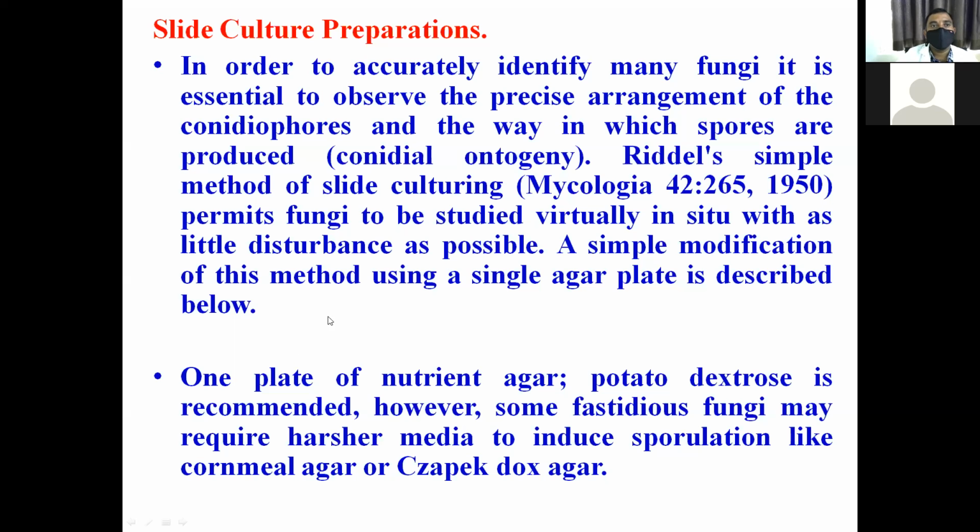How will we prepare slide culture preparation? One plate of nutrient agar, potato dextrose agar is recommended. Sabouraud dextrose agar, please. However, some fastidious fungi may require harsher media to induce sporulation, like cornmeal agar. Already I said this, cornmeal agar or Czapek-Dox agar. Some fastidious fungi may require these types of media especially.